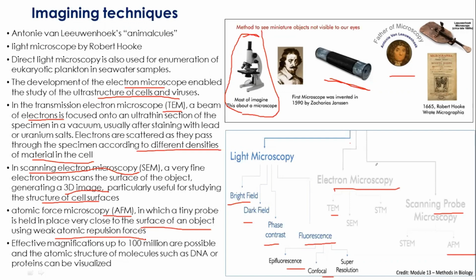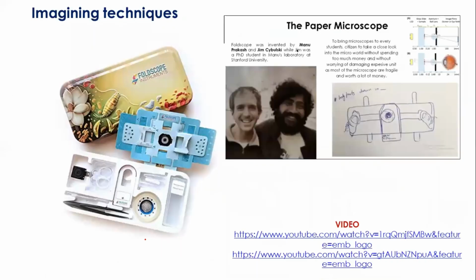So all these imaging techniques have emerged in the past century, and have been extensively used to study the marine microbes. A very recent one is the foldscope, which again I hope that many of you have seen, or at least, if you don't have the option to check it, have at least seen it.